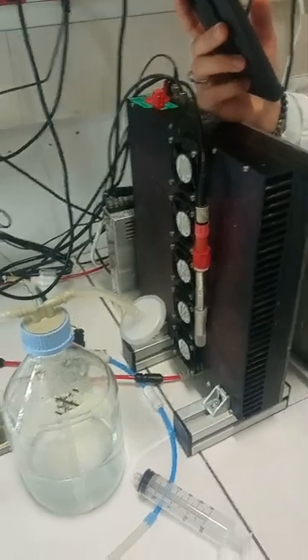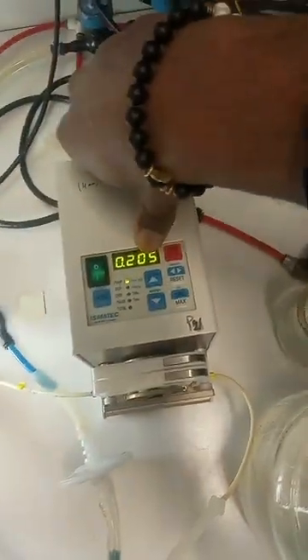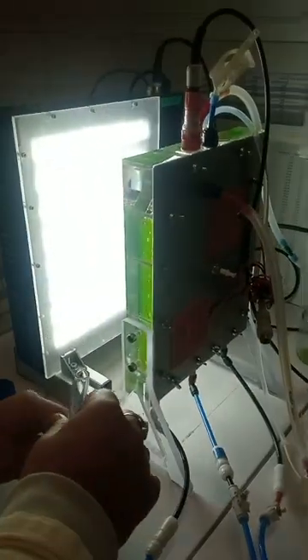Our cycle is 24 hour continuous, not a day-night cycle. So we have to remove this, and we just measure how much we obtain in milliliters in 1 minute. Flow, pipe out.